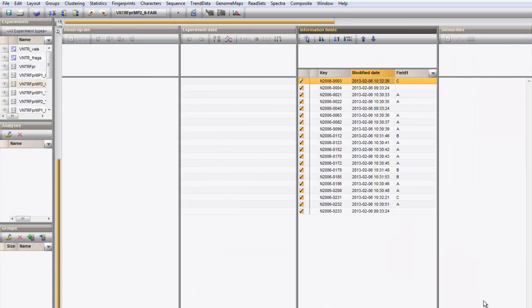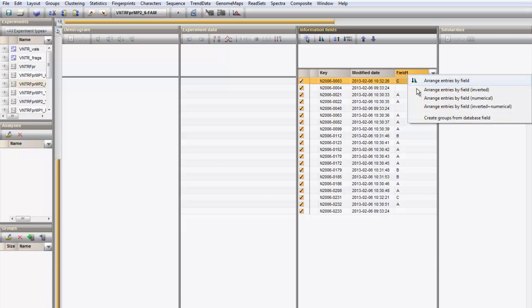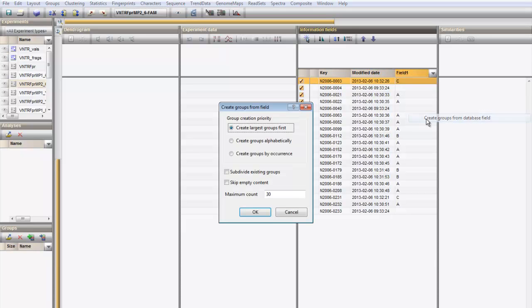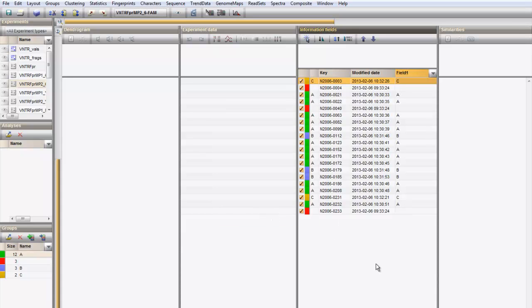You can use a database field to create colored groups. Right-click on the field heading and choose Create groups from database field. Display the VNTR values by clicking on the icon next to the experiment VNTR VALs.